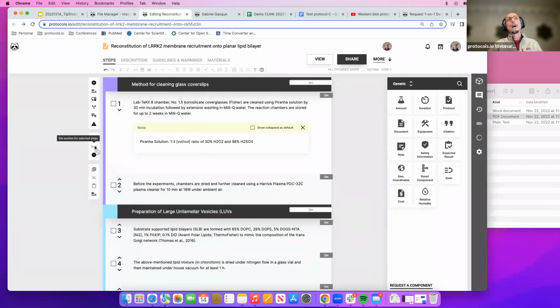Now, in addition to this protocol being shareable, publishable, versionable, and forkable, the same way that I showed you in the previous version in which you just attach the document, this way of doing it takes more time, but transforms the protocol into a live document that accepts comments and can be run from the computer and tablet.